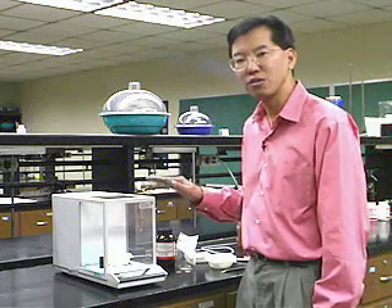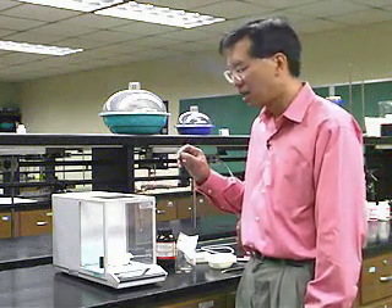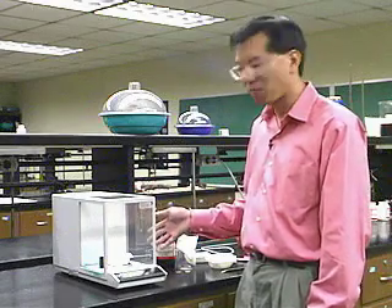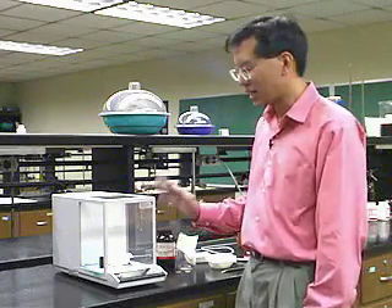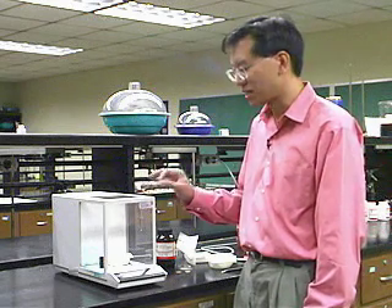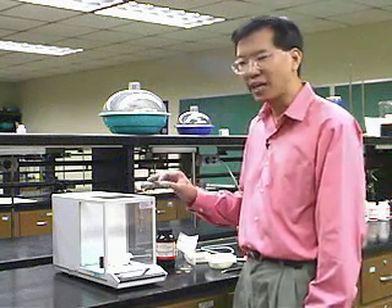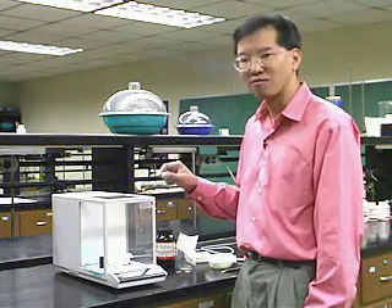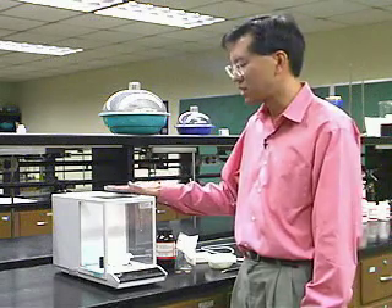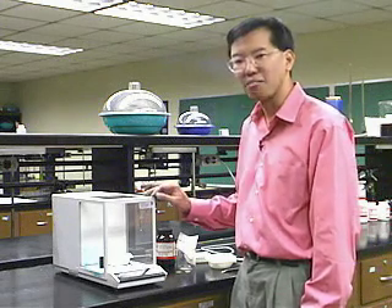You're going to use this tool quite a bit in your laboratory, so get used to using it. Try to be neat, and if you make a mess, clean up after yourself. Leaving a mess is one of the ways to really destroy a very sensitive instrument. Some of the things you'll weigh will be corrosive and caustic, so it's really important to take care of something as precise as an analytical balance.